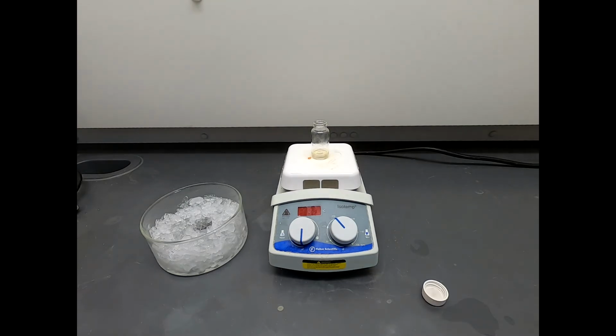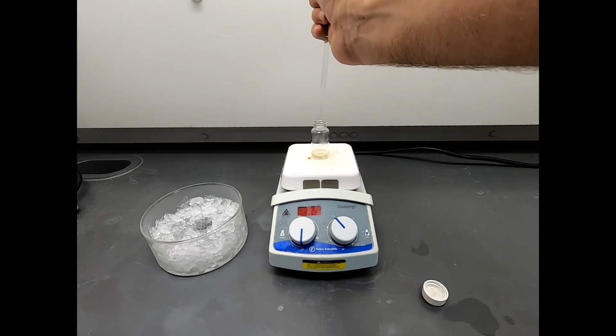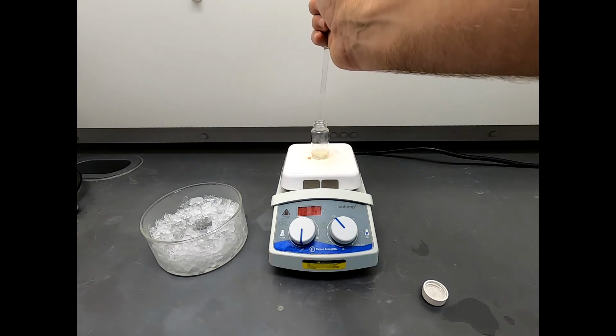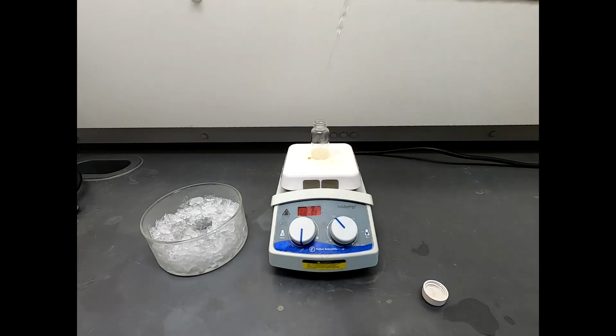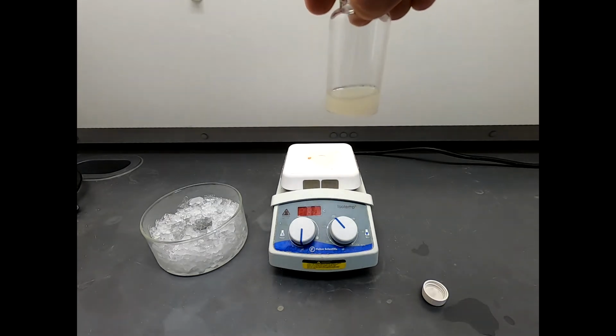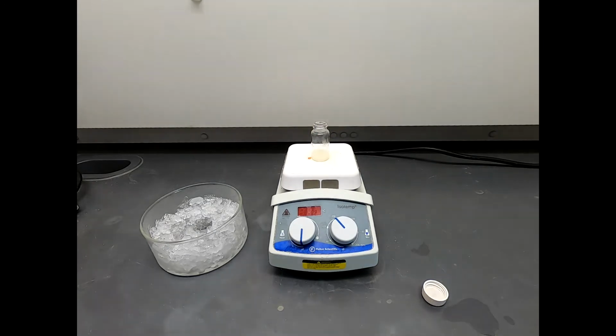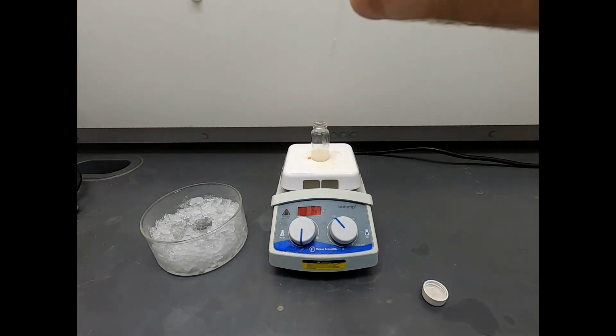And I'm going to add about 3 milliliters of water. We have about 3 milliliters of ethanol. I think I added a little bit more, but about 3. So we're going to add water in here as it stirs. And as soon as I can see some clear solid, it's looking like solid. Okay, let's hold this up now. I'm not sure if you can see, but that's definitely got some cloudiness to it. That is some precipitate, and we've really added very little water.